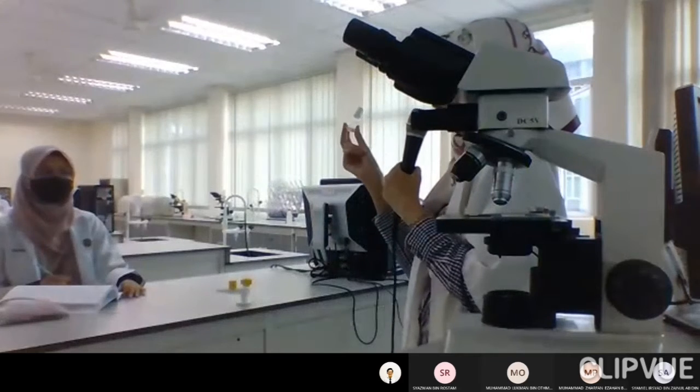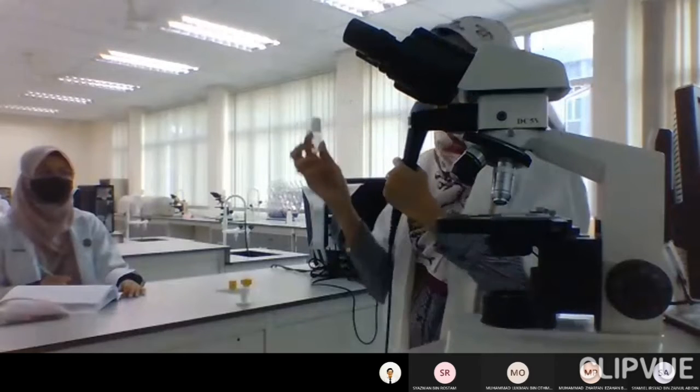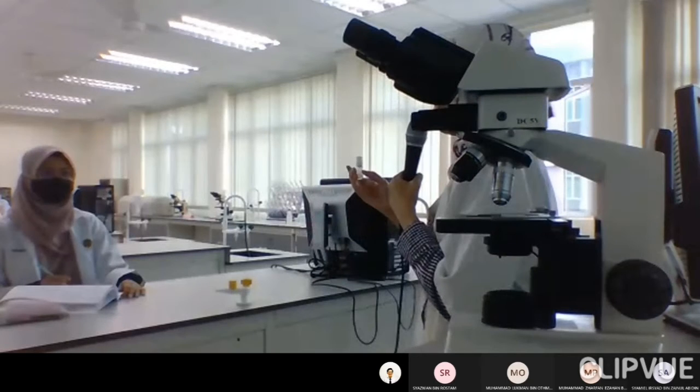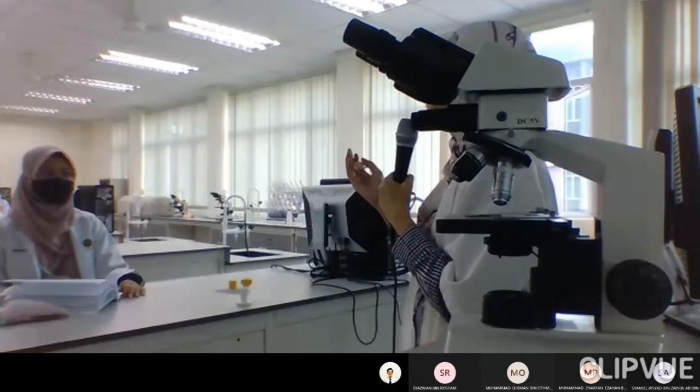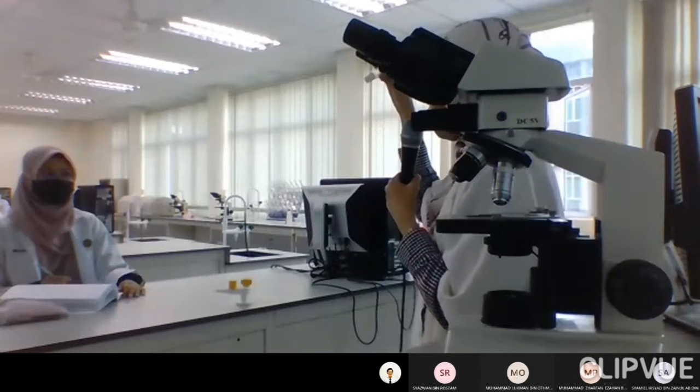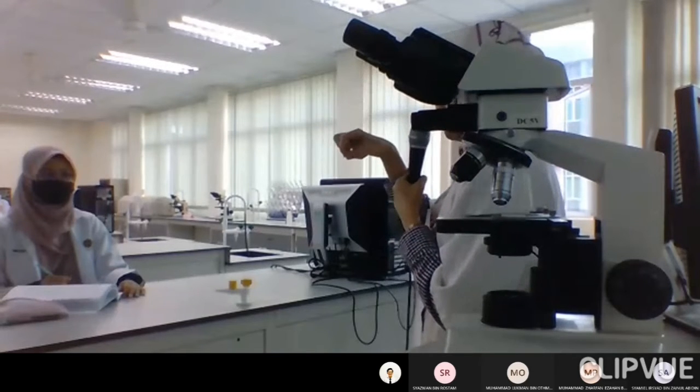This is the immersion oil. We need to put a drop of immersion oil onto the slide or cover slip. Because of course you're going to use the cover slip, this one is a wet mount. You need to use the cover slip. Put just a drop of oil on the cover slip.